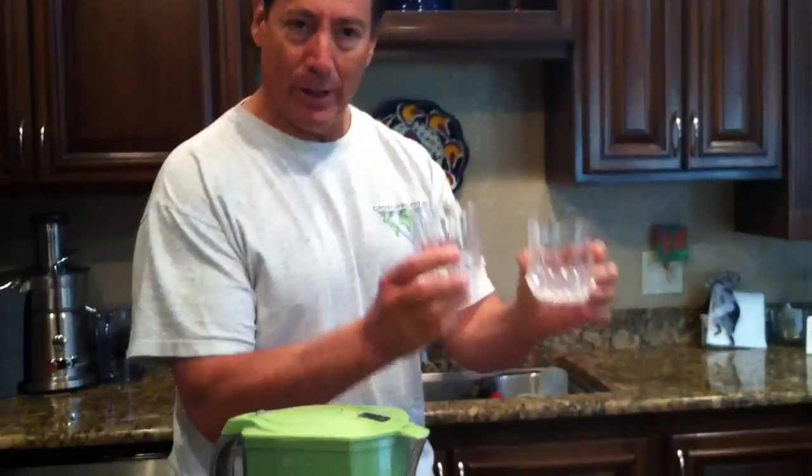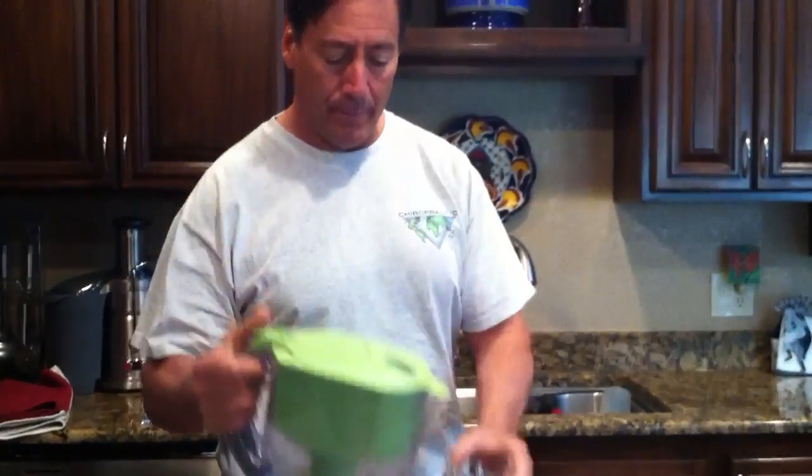You need to get yourself a little bottle of this, it's like three bucks or something. Then we're going to have two glasses to demonstrate: one with purified filtered water and one with non-filtered water. In one glass I'm going to pour filtered water, and in the other I'm going to pour regular water from the tap.